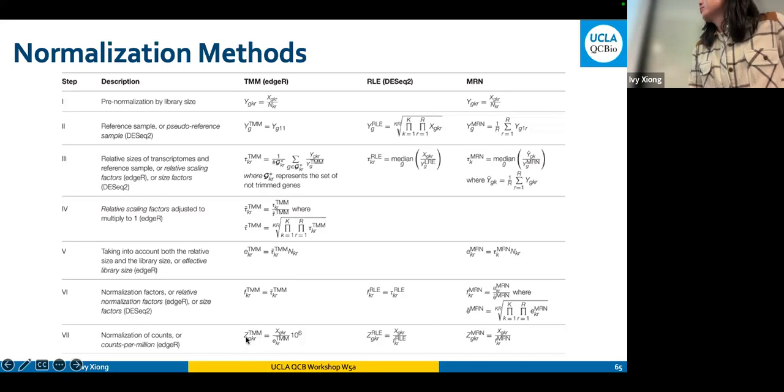In the end, we get a kind of Z readout, more like a Z score, where the gene expression level has been scaled so that we can compare between samples. I think this is a good table to look at occasionally if you want to compare different software outcomes. This is quite standard practice using DESeq2 normalization.